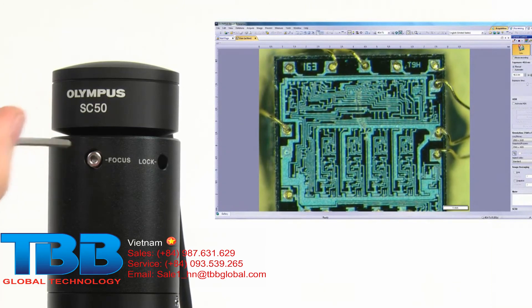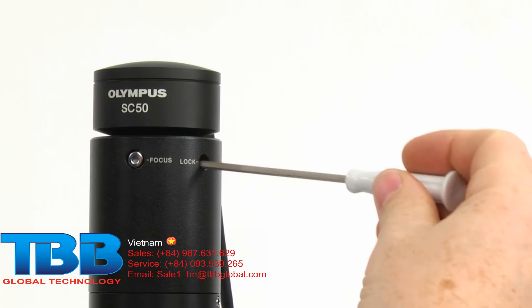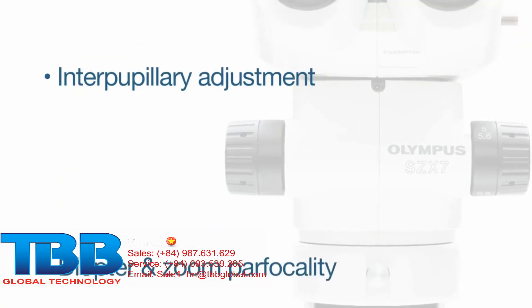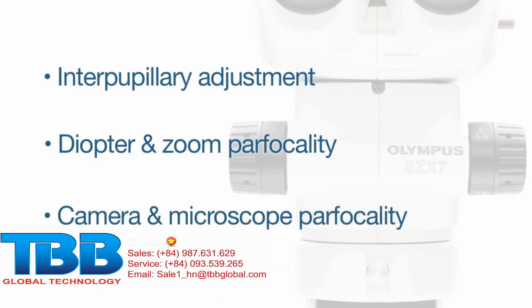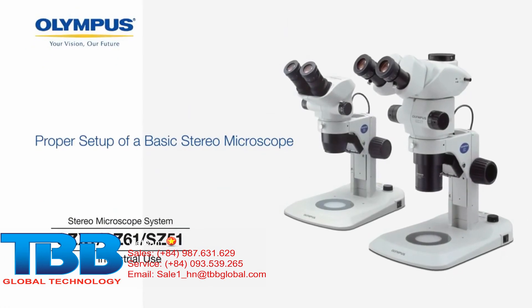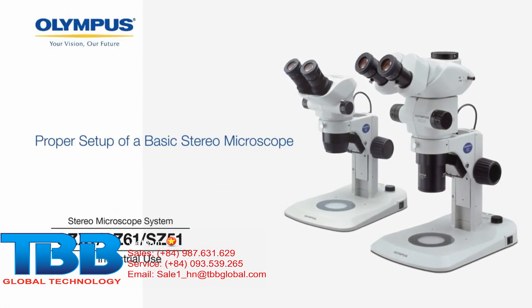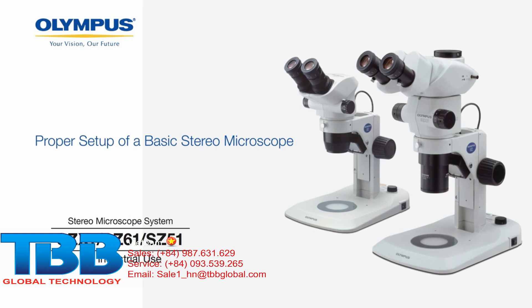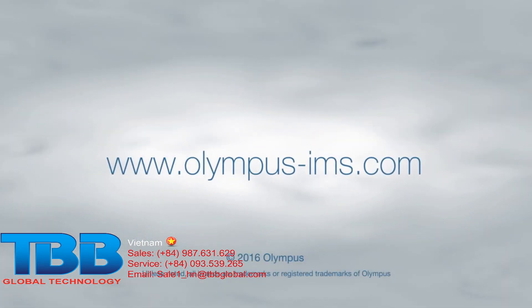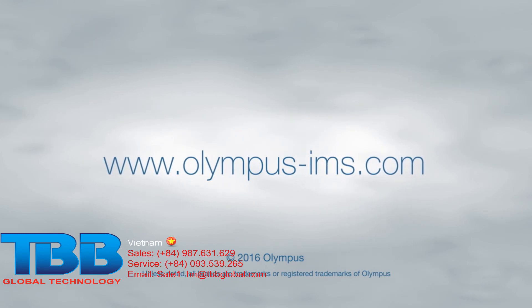If your camera adapter has a locking mechanism, lock it into place. By making these three simple microscope adjustments, users will be able to make more comfortable and efficient observations. For more information on Olympus industrial microscope solutions, contact your local representative or visit our website at www.olympus-ims.com.